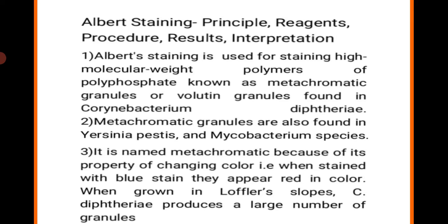These are also called metachromatic granules because when these granules are stained with a blue colored stain, they appear red in color. So due to this property, they are named metachromatic granules.